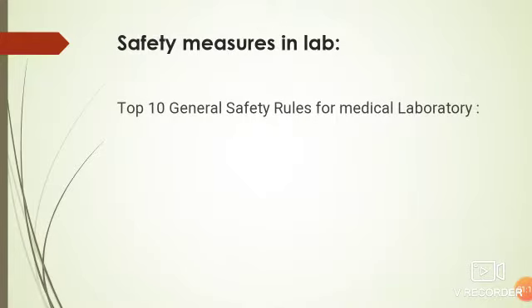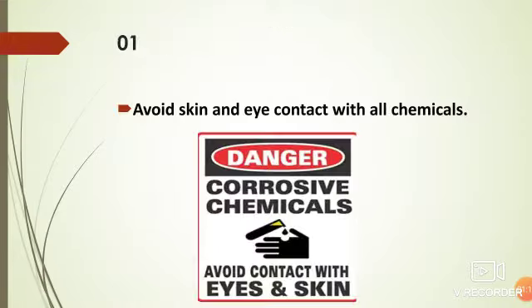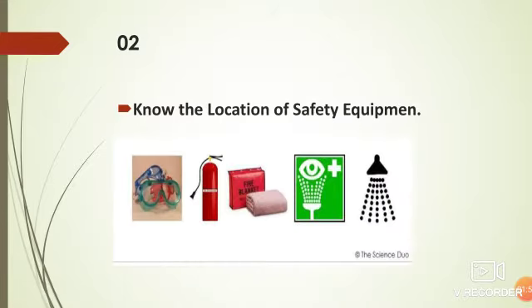Now, there are ten general safety rules for the medical laboratory. Let's discuss about all these one by one. First of all, avoid contact with eye and skin, because it may result in local reactions such as burn or rash, or absorption into the bloodstream. Absorption into the bloodstream may allow chemicals to cause toxic effects on other parts of the body. So we should take care that no chemicals come in contact with our eyes and skin while working in the lab.